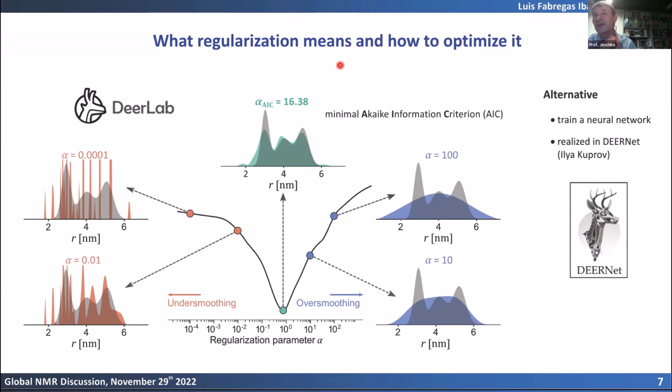So if I shift each distance in the ensemble model by 3 angstrom or 6 angstrom, I wouldn't see much difference in the ensemble model. So in a way, we live from the fact that the proteins are disordered. If the disorder is much larger than our uncertainty, then we can make a reasonable model.